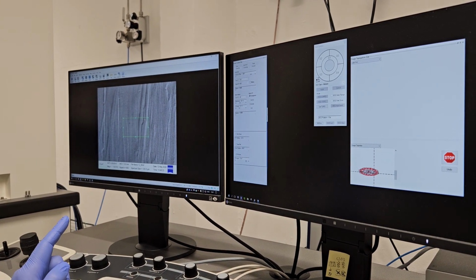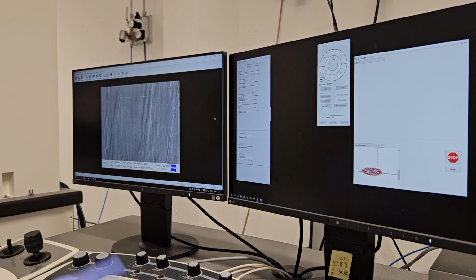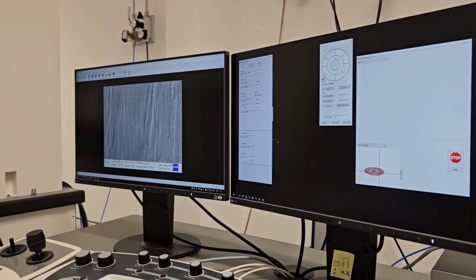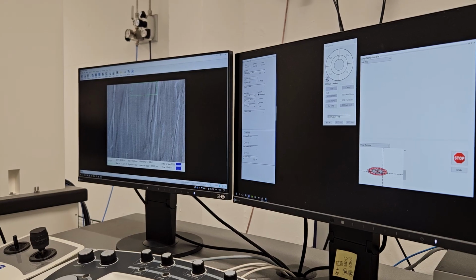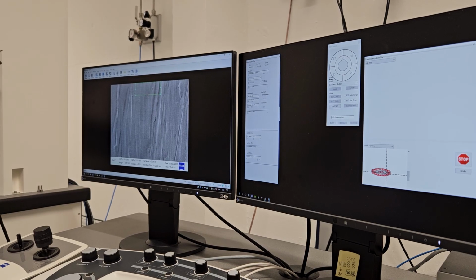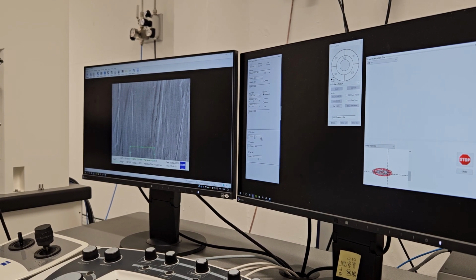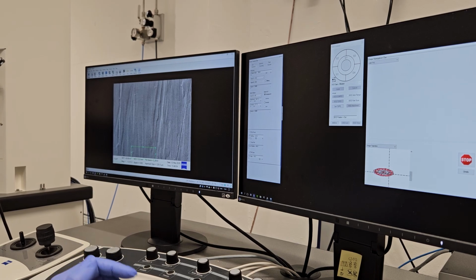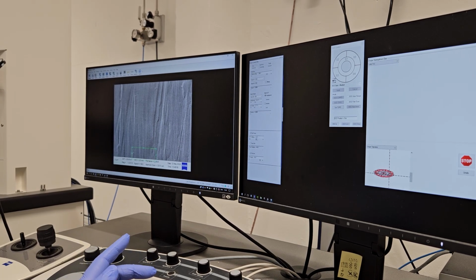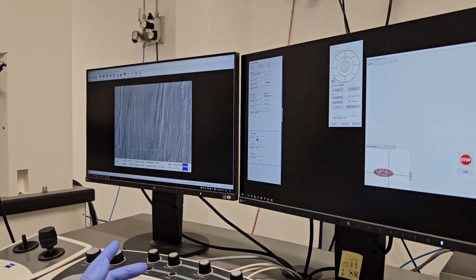But if you go and check focus at the bottom and top, then don't touch this. Then you should use this dynamic focus. No, it will not be automatic. You need to write the right focus. So you simply use either this or that, but that's not a good idea.